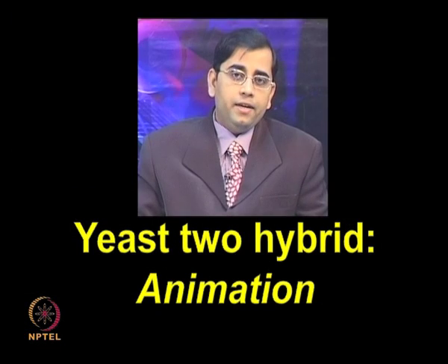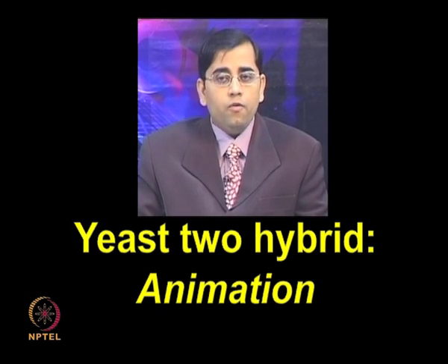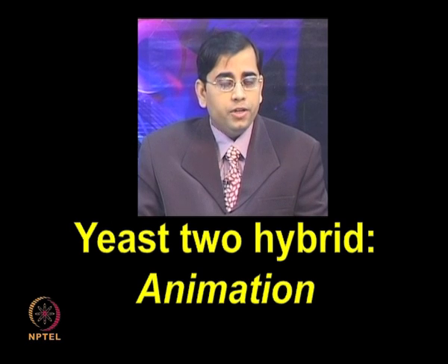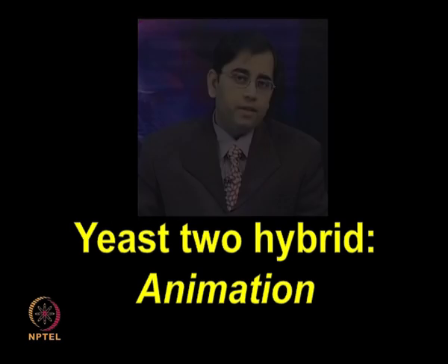So, yeast two-hybrid screening remains a novel molecular biology technique which has been used for screening and discovery of protein-protein and protein-other biomolecular interactions. Let me show you how yeast two-hybrid works in the following animation.